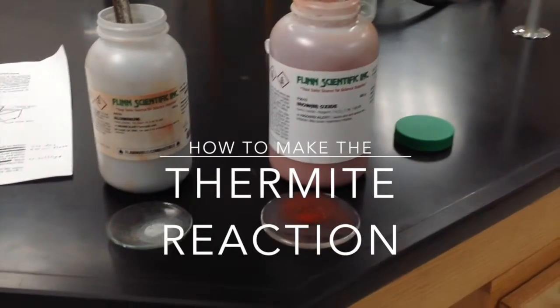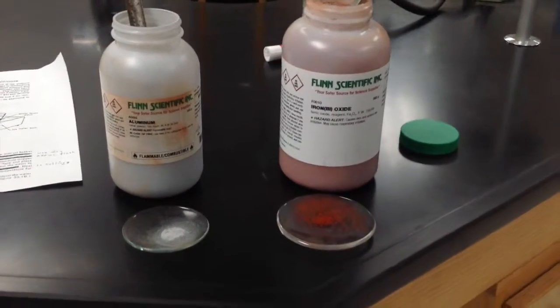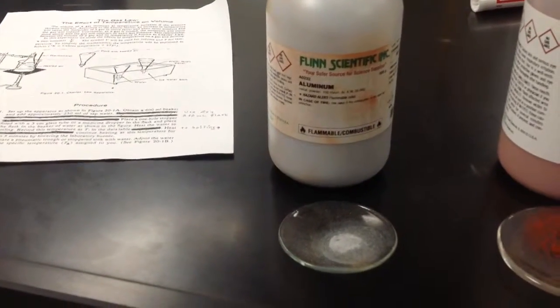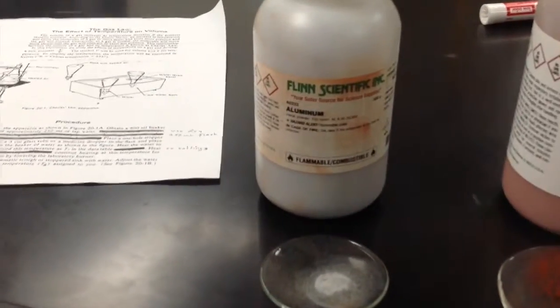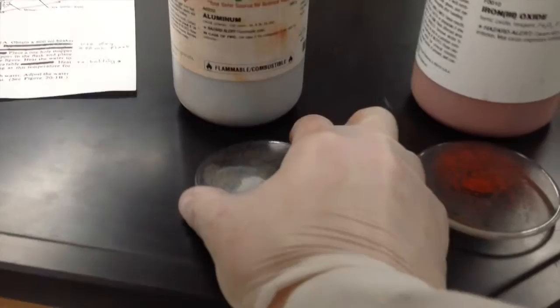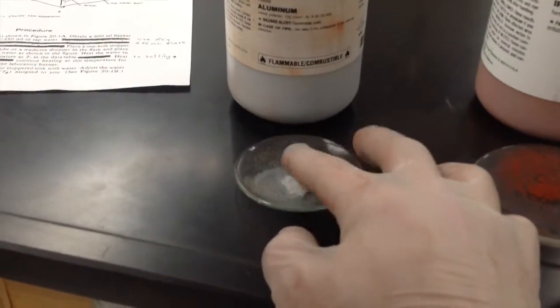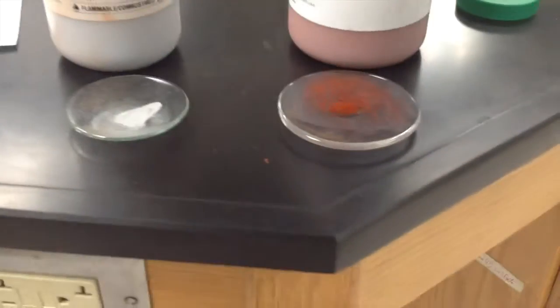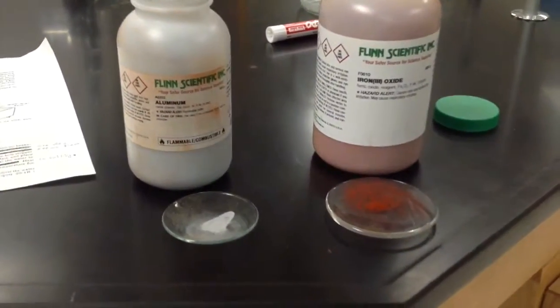So let's introduce you to the cast of characters here. We have two chemicals. We have iron 3 oxide, which is a red powder, and aluminum powder, which is metal, just like the aluminum foil you use in the kitchen. Except instead of being a solid in the sense of a sheet, this turns out to be a very, very fine metallic powder, just like an aluminum dust. And these are the two chemicals I need to combine together to make thermite.